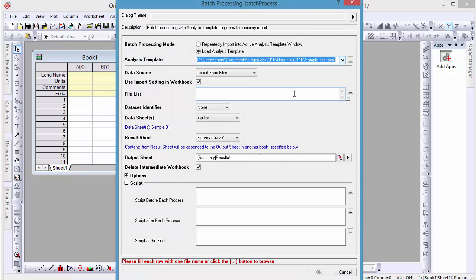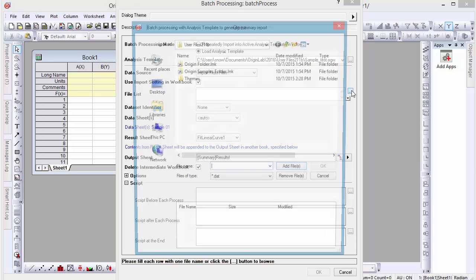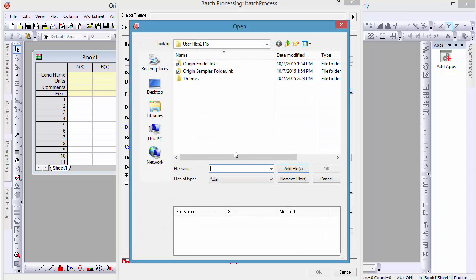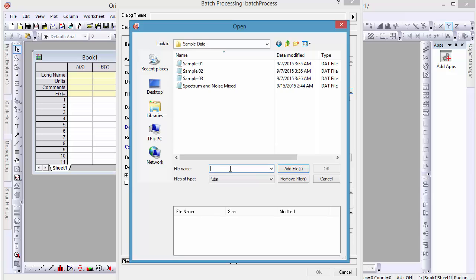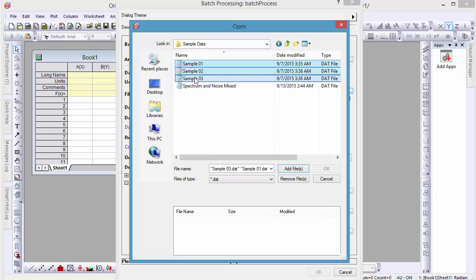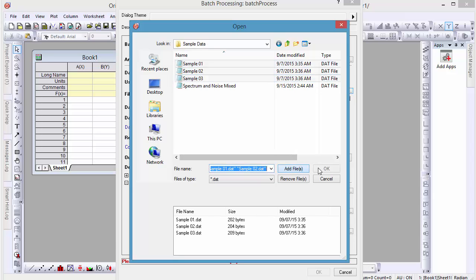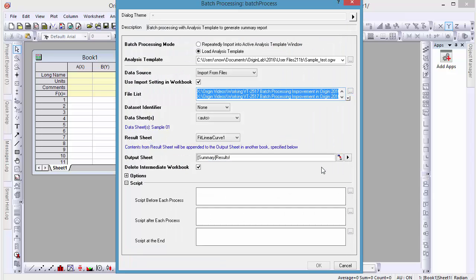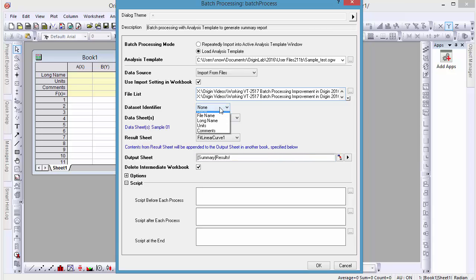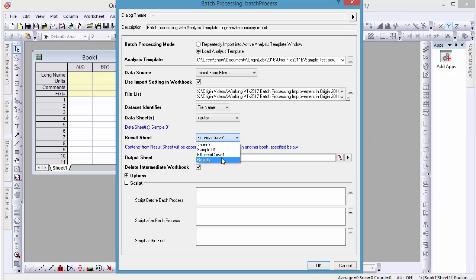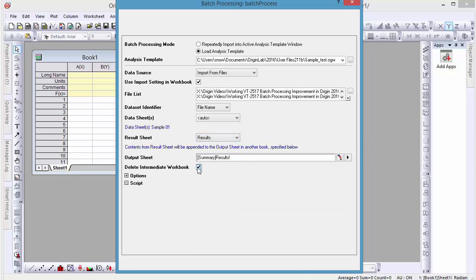Now let's import some data. Set our dataset identifier to File Name. Enter Result Sheet to Results, the sheet we used to summarize our previous workbook. Uncheck Delete Intermediate Workbooks so we can see the workbooks for each set of data with corresponding analysis.